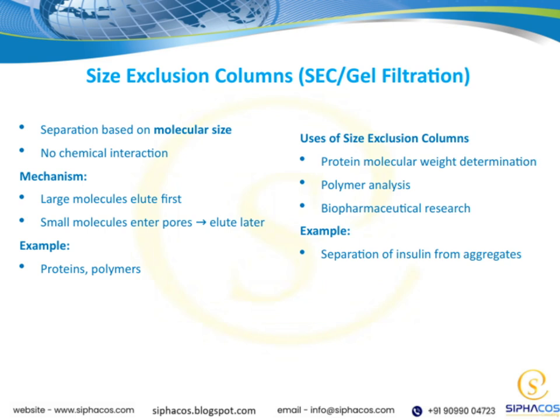The core principle behind SEC is simple but powerful. Separation is based purely on molecular size. Unlike other chromatography methods, there's no chemical interaction involved. Instead, larger molecules, like proteins or polymers, are excluded from the pores within the beads and thus elute first. Smaller molecules, on the other hand, enter the pores and take longer to pass through the column, so they elute later. To sum up, SEC is an elegant way to separate molecules based on size, making it invaluable in many research and pharmaceutical applications.